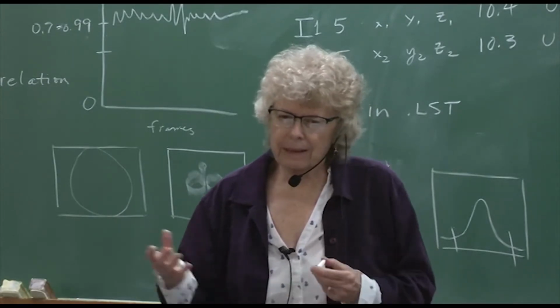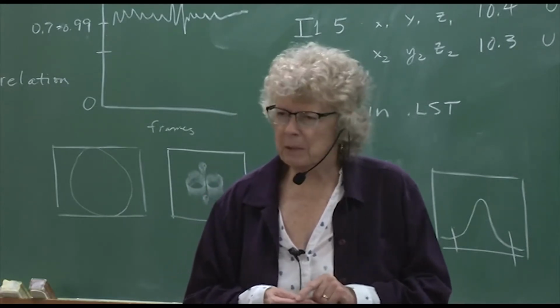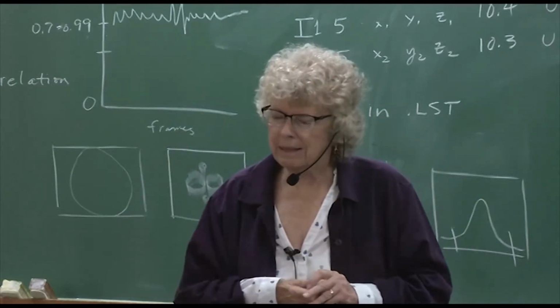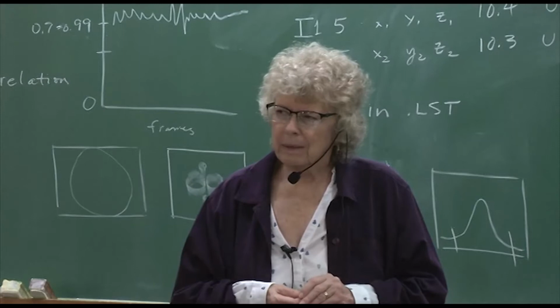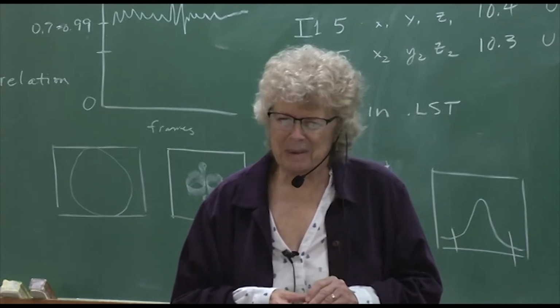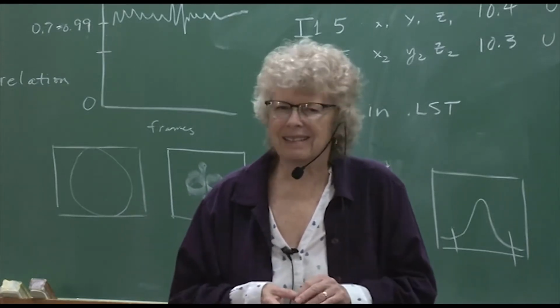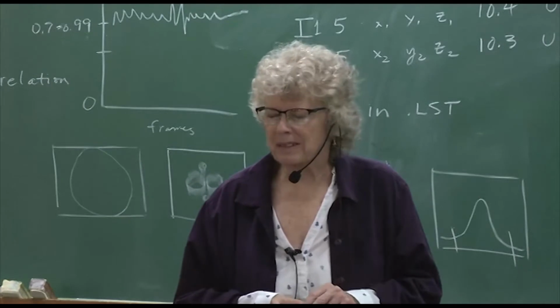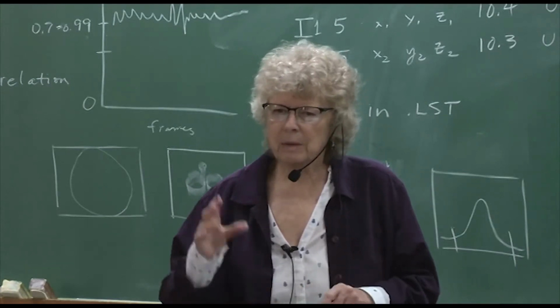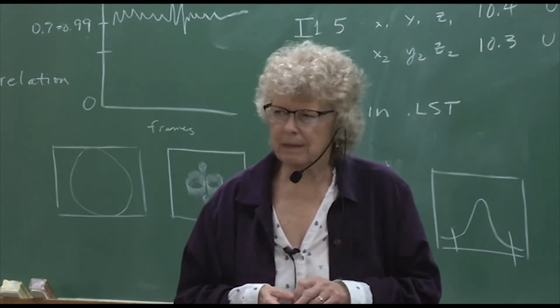Yeah, the CGLS was a kind of more gentle refinement, which didn't require inverting hard, big matrices. But it was slower, much slower. You don't have to do that anymore. You know, you can do least squares in less than a second now of pretty big structure. It's simply amazing. So the old methods where you use blocks and CGLS, that was just because of computer restraints.